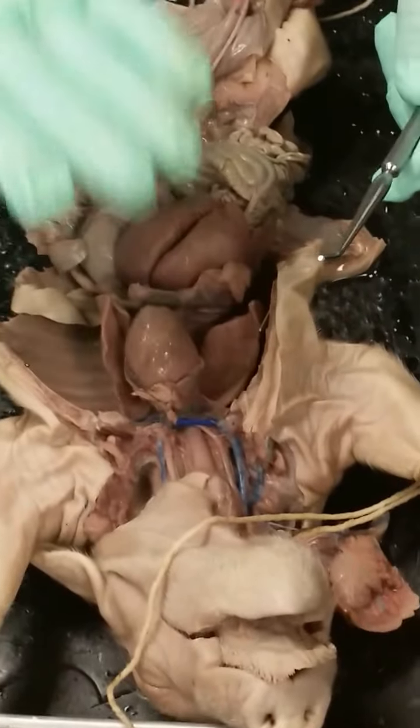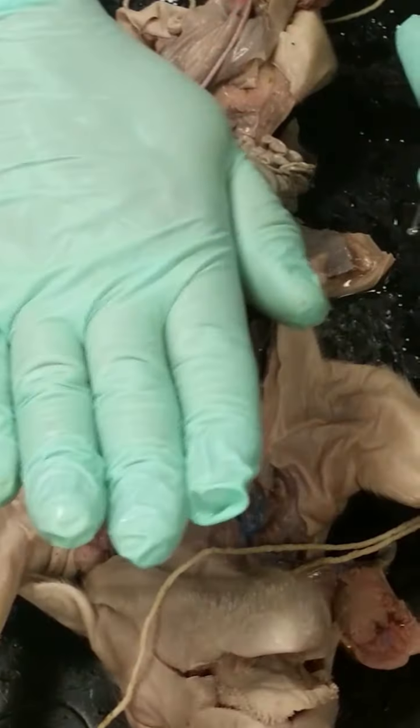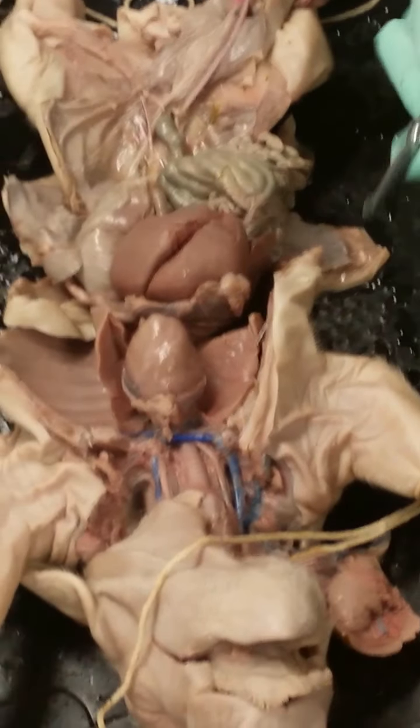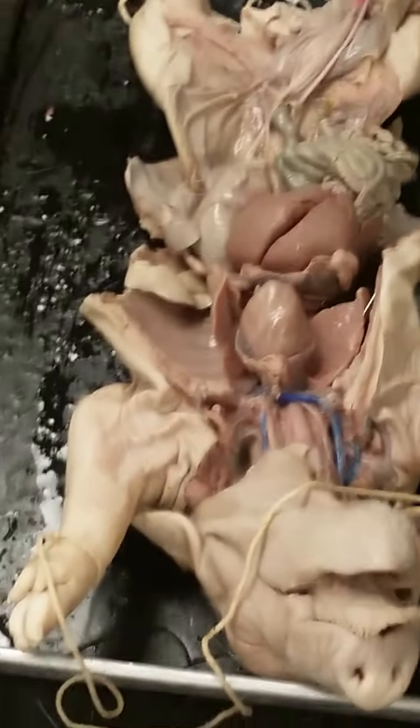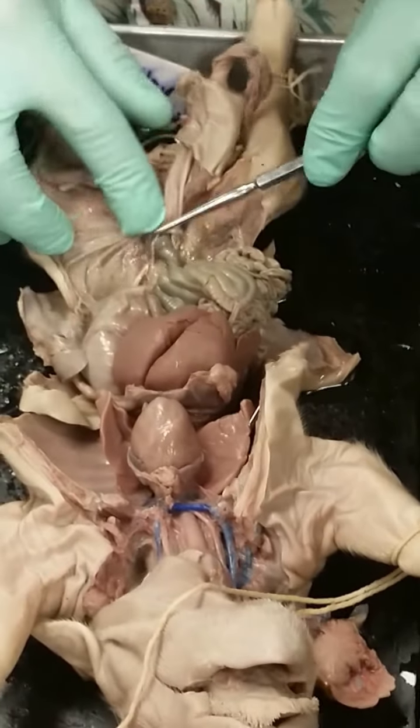Because remember, the heart is really kind of centrally located. So the aorta has to come up to meet it. So, same in your bodies. Okay? Same in your bodies. Let me see if there's one other thing that I can find.